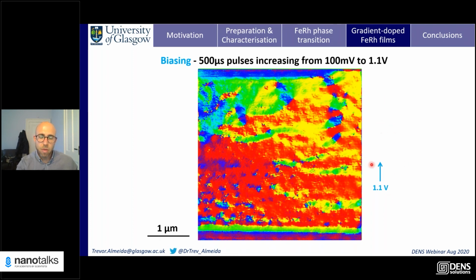So it's worth mentioning that, in the grand scheme of this experiment, this was one of the large voltages that we applied. We applied current pulses up to a point where nothing more would happen, and then we increased the voltage. And so again, we applied current pulses until nothing else would change, and then we increased the voltage again.